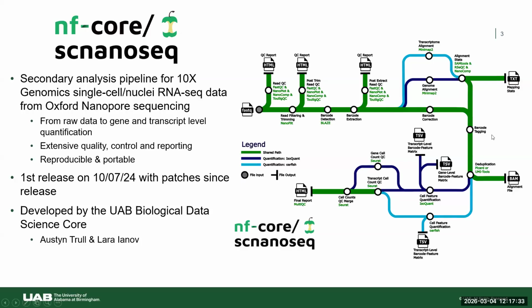And then importantly, we add the metrics from the cell barcodes, including corrected metrics, back into the BAM files through a process called barcode tagging. This is pretty important if you want to look into detail. The BAM files allow you to check how many reads contain cell barcodes that did not need correction, and cell barcodes that were corrected. There's a specific set of columns in the BAM file where you can extract that data. So that is all present after this particular step.